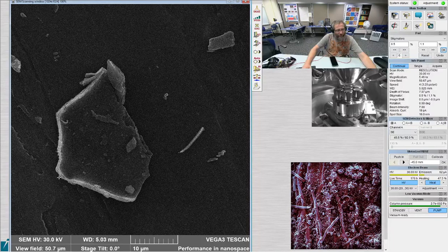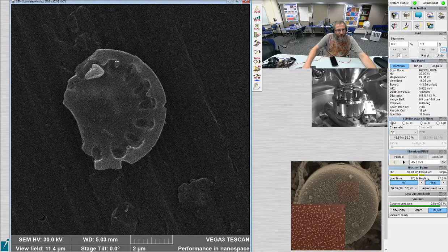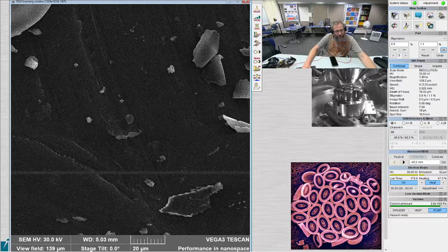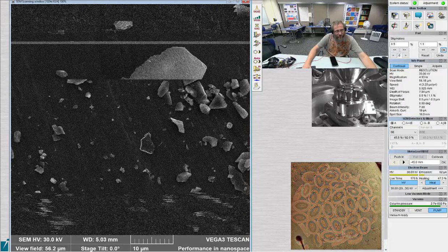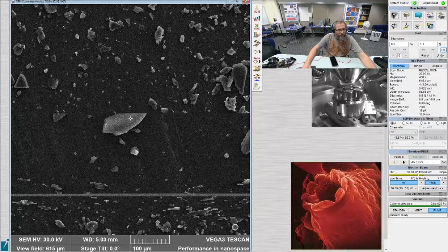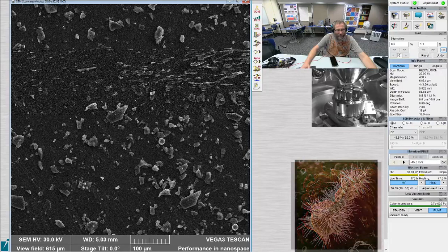Also, what was this thing up here? Oh, okay. Like Cyclotella meneghiniana almost. Sure. Whatever that was, it's really weird. Yeah, I don't know. It doesn't remind me much of other things that live in lakes. Looks diatom like. But just a piece of something, I can't tell.